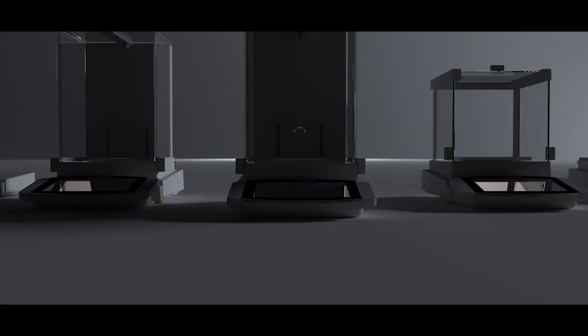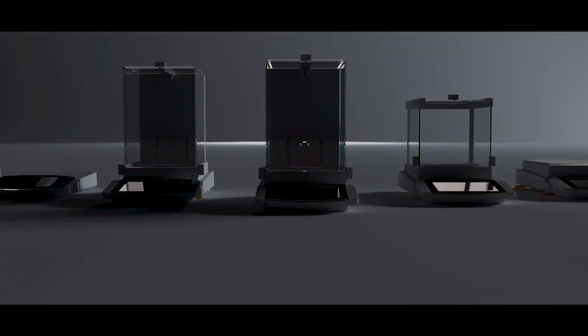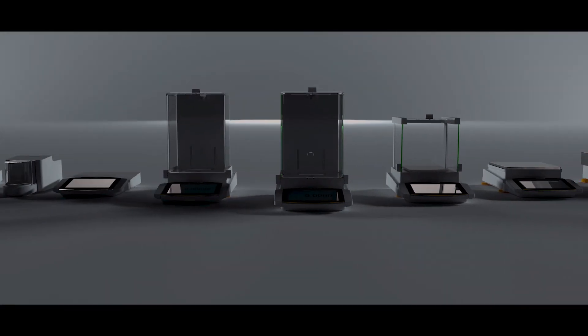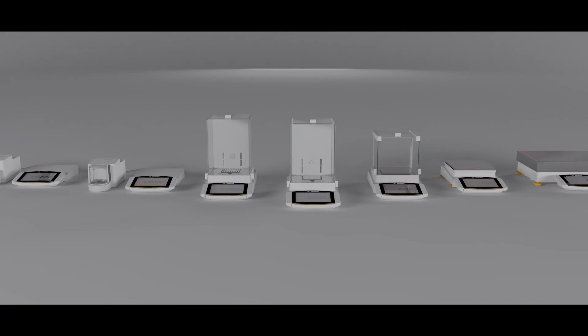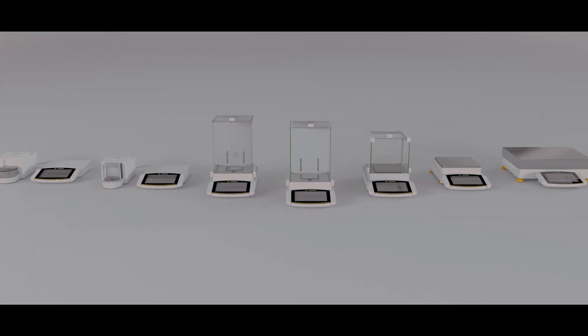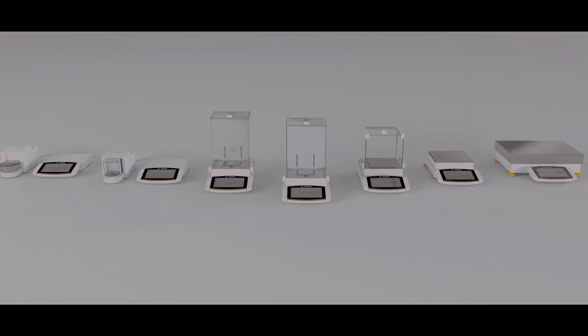And now, the time has come for the next generation of Sartorius premium balances. Cubis II.